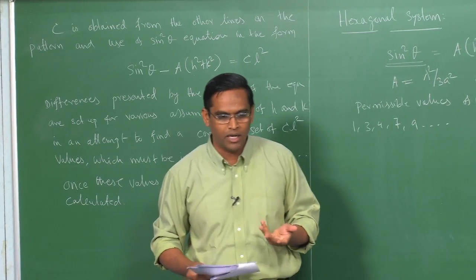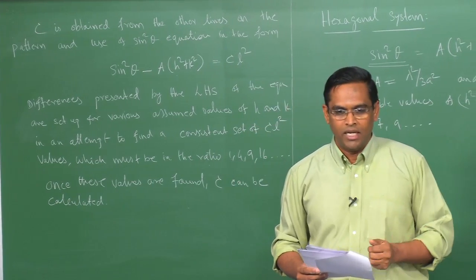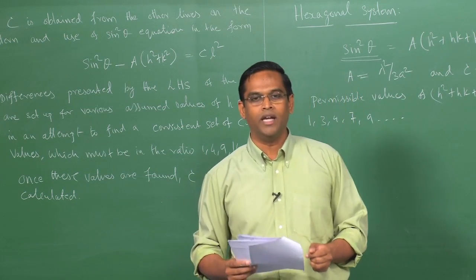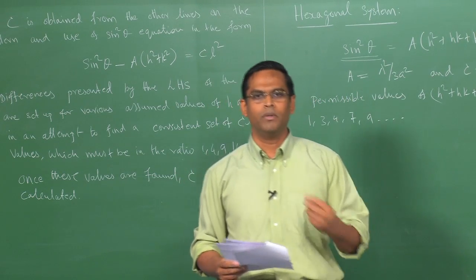So I will just move on to the next application called phase identification, which is another very important application of X-ray diffraction. For example, if you have a material which has a mixture of 2-3 phases, how these phases are identified through X-ray diffraction, that we will see with a simple case study.